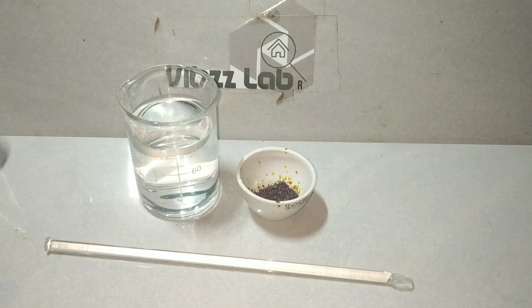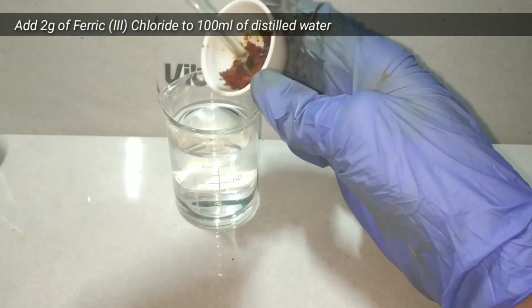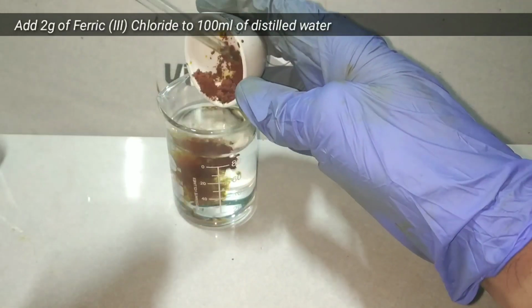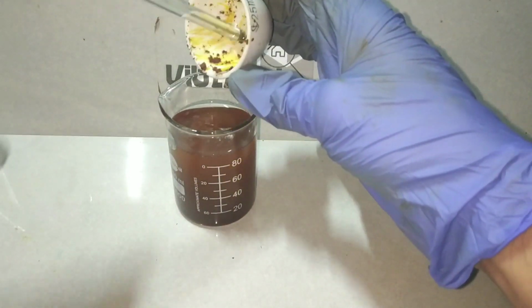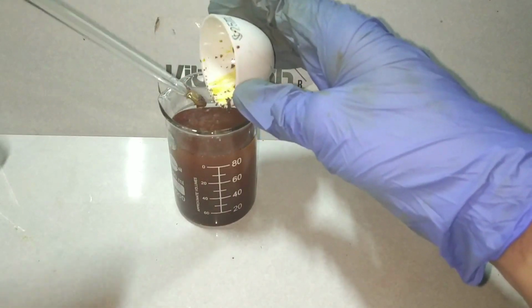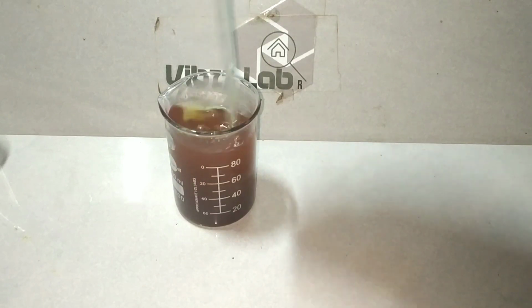First of all, let us make ferric hydroxide sol, which is a lyophobic colloid. For that, we have taken 2 grams of anhydrous iron 3 chloride and 100 ml of distilled water, and we dissolve the iron chloride in the distilled water. Stir it up with the help of the glass stirring rod.